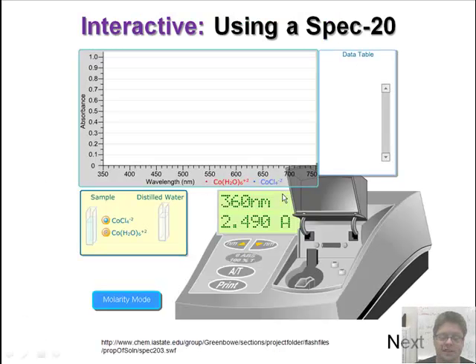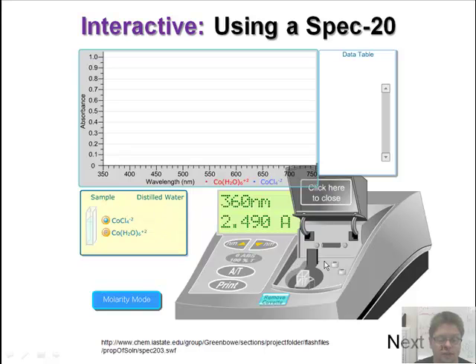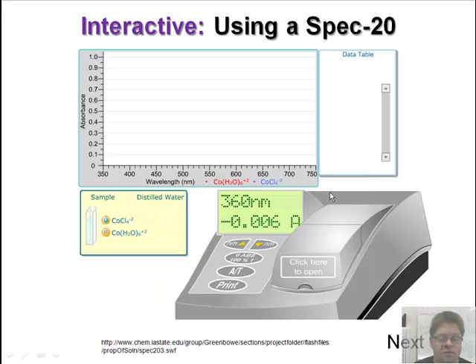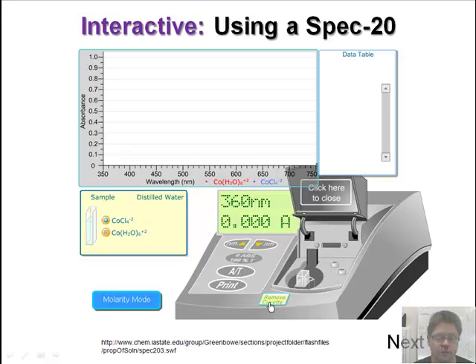Using a spec 20, some guidelines for using a spec 20. First of all, the first thing that needs to be done is you need to use distilled water as a blank. Close it. It measures the absorptivity here. Here we want zero absorptivity, so we would need to calibrate the spec 20. So we press zero. Now the water is at 0.00. We can change it between transmittance. 100% transmittance goes through the water according to the standard baseline. Absorptivity is 0.00.